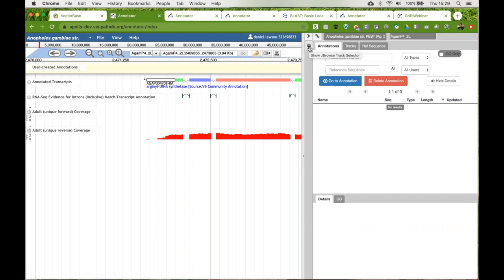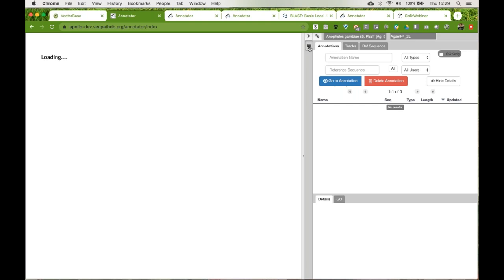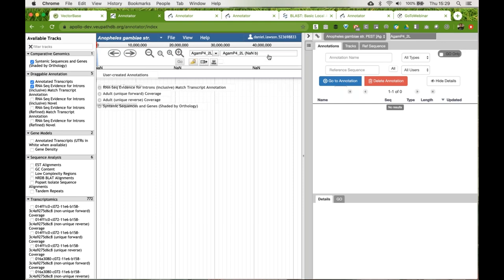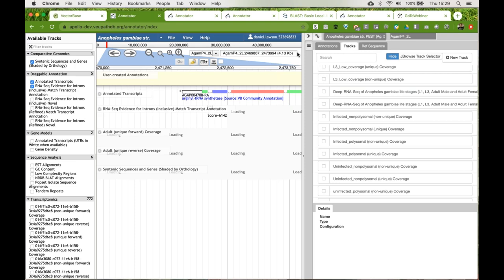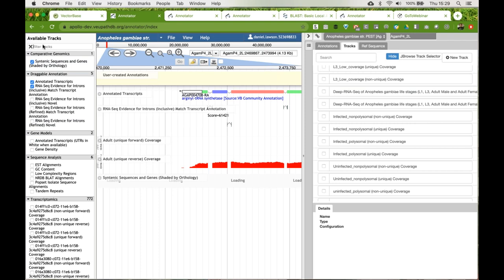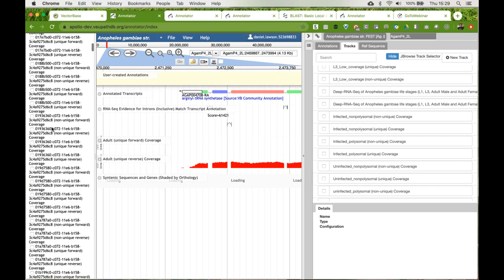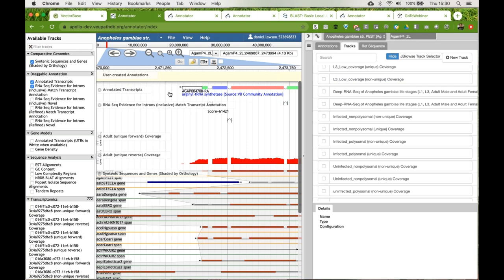The other button opens the JBrowse Track Selector, which makes a new panel on the left-hand side reiterating all available tracks — evidence tracks you can turn on — in a way that's a little more easy to interact with. Here you have the ability to filter tracks by name or type, so you can, for example, see only coverage plots for all RNA-seq. Three panels total: one to turn tracks on and off, one to do the main work, and one to give summaries of the data.